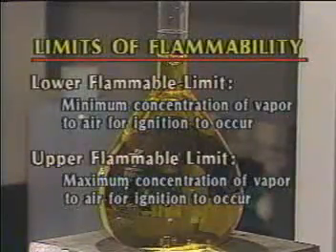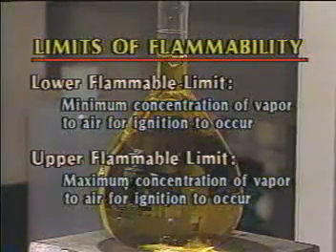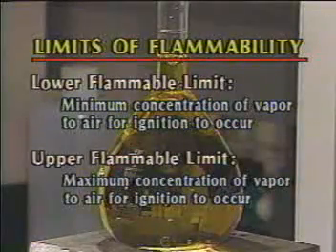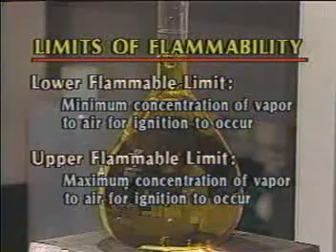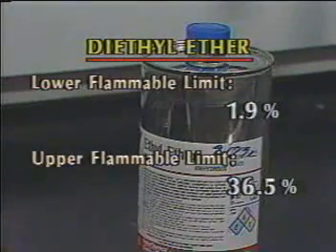A chemical's lower flammable limit is the minimum percentage of vapor to air required for ignition to take place. There's also an upper flammable limit. If the percentage of vapor to air increases beyond this figure, ignition is no longer possible. The limits of flammability for diethyl ether, for instance, range from 1.9% to 36.5% by volume of air.